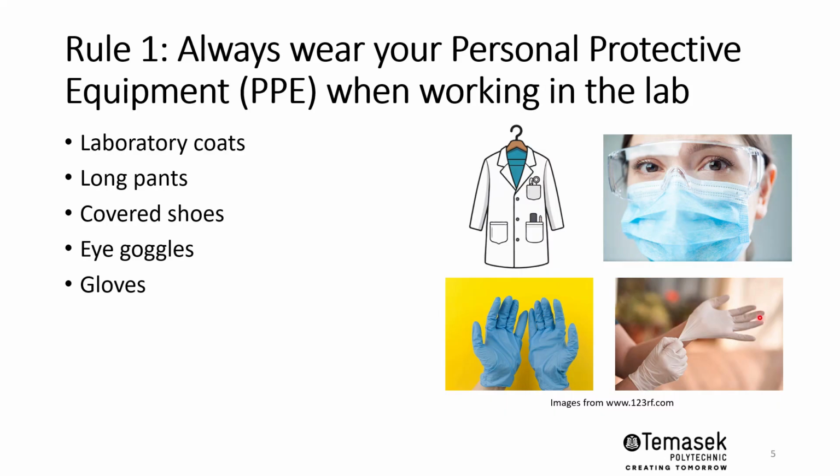Latex gloves are on the right here. You will find these latex gloves are typically used in the hospital setting. They are good barriers against blood, but they have poor chemical resistance. If you're using chemicals, preferably nitrile gloves will be the way to go, and especially if you have any latex allergies.